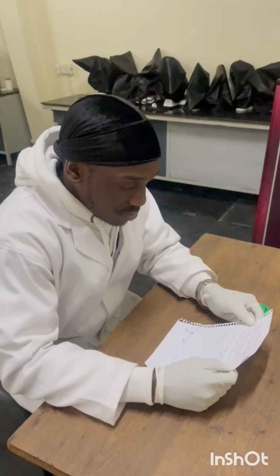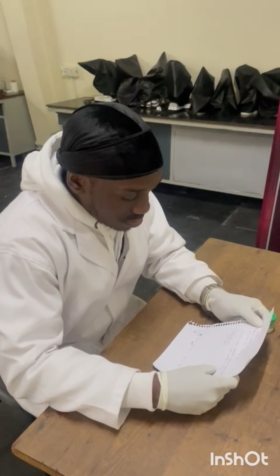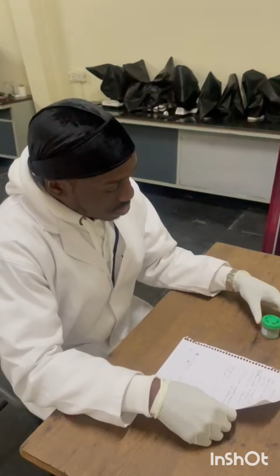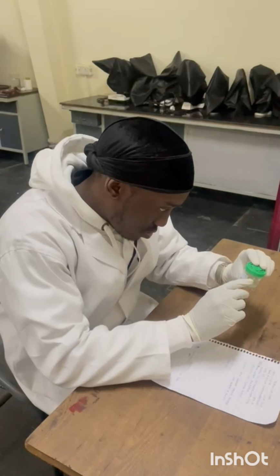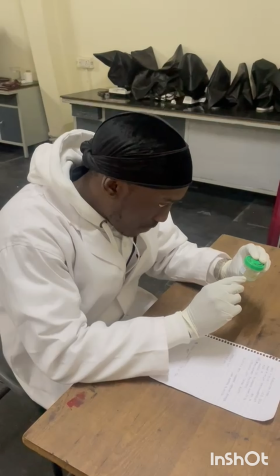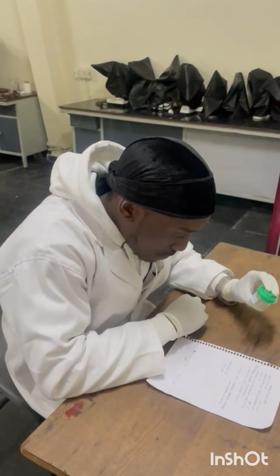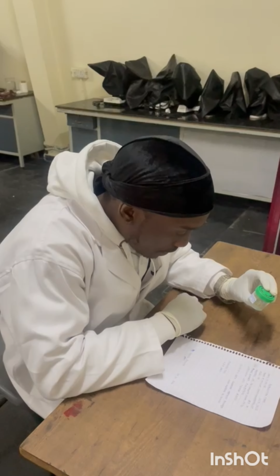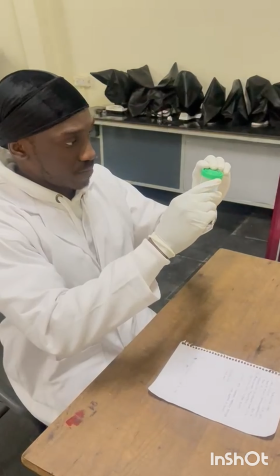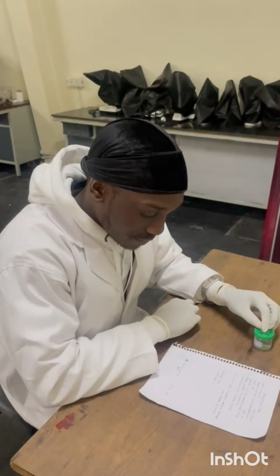The importance of proper sample reception. 1. Accurate patient identification. It ensures that correct patient sample is processed and reported, preventing mix-ups and misdiagnosis. 2. Correct specimen type. Verifies that the received specimen is the correct type, ensuring that the appropriate tests are performed. 3. Adequate sample quality. Ensures that the sample is received in good condition with minimal degradation and contamination.